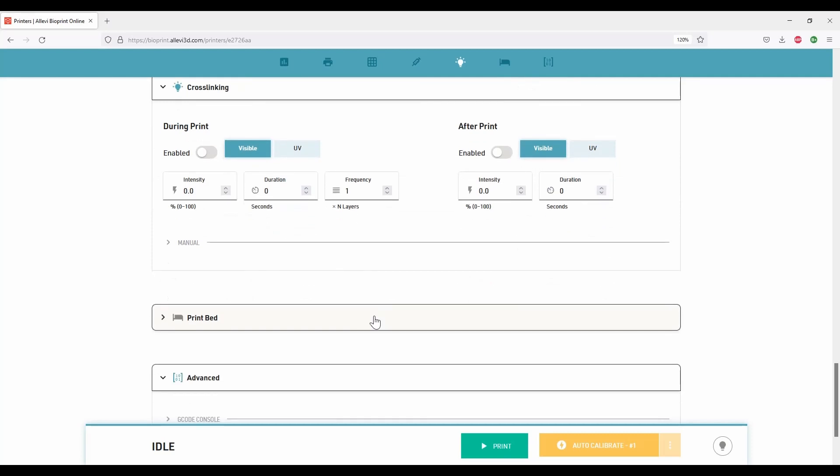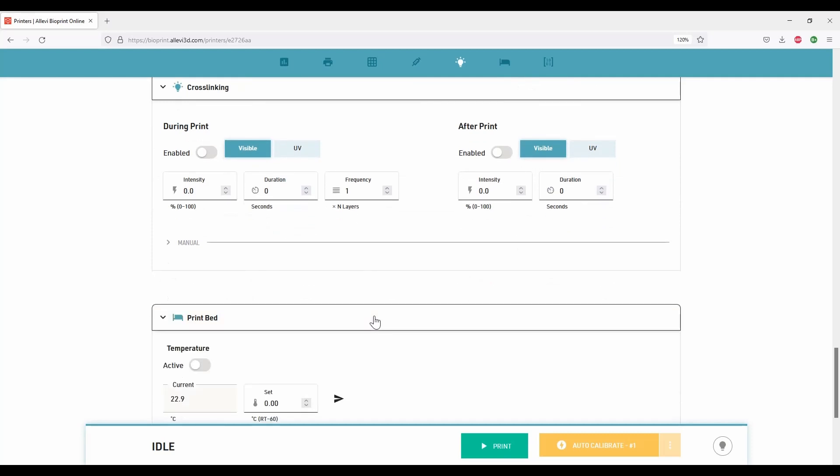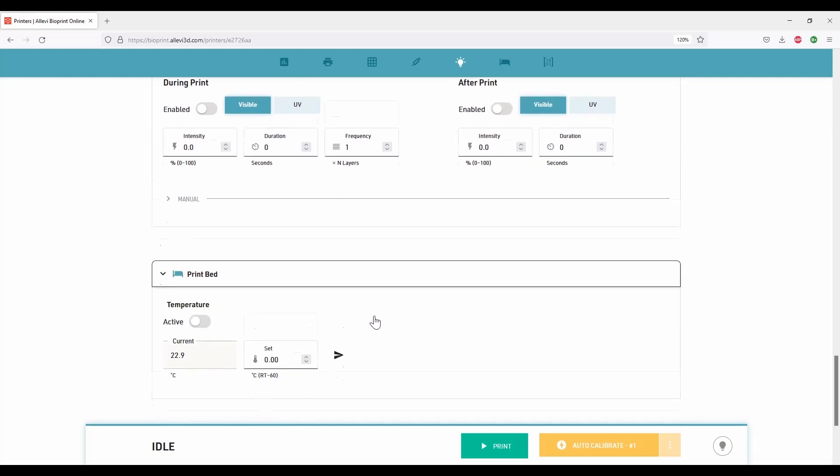Next section is the print bed. The print bed can be heated from room temperature up to 60 degrees Celsius. Toggle the bed temperature to active, enter the desired temperature under set, and click the green icon.